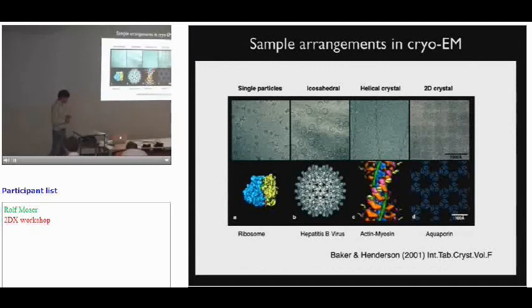And since then, certain subdisciplines have emerged. One of them is single particle. Each of them is particular and depends on the type of sample you're working with. Then there are icosahedral viruses and helical specimens, and of course, what you all know about 2D crystals. And while there was a discrimination between these disciplines, now it actually appears that we don't really have these strong borderlines. In fact, a lot of the techniques are merging together.